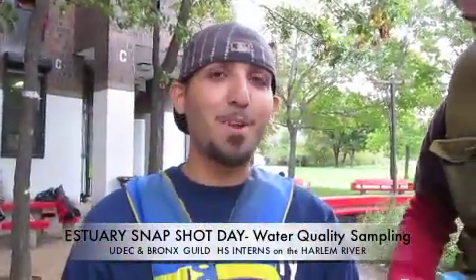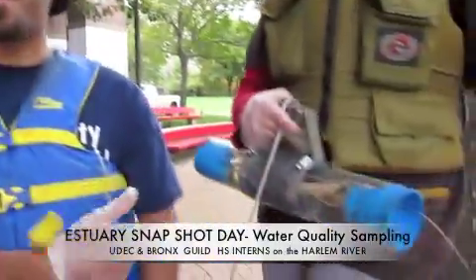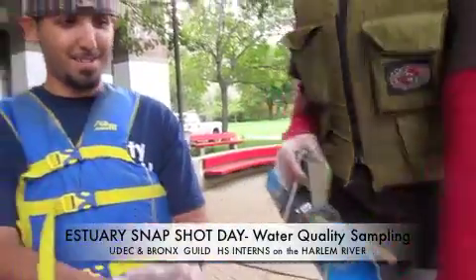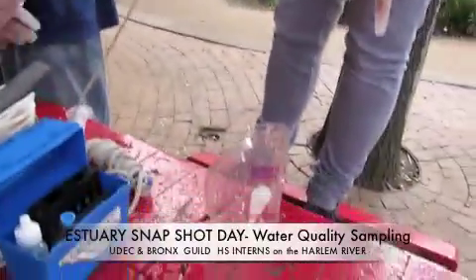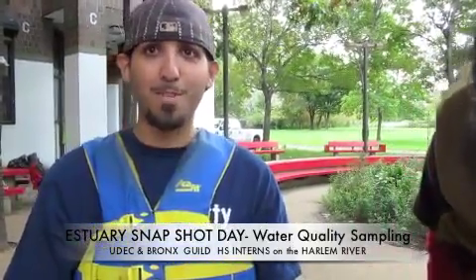The next test we are doing is for salinity. We're gonna be testing how much salt is in the water from the Harlem River into the hydrometer. How does the hydrometer work? The more salt in the water, it moves the needle. The less salt, it stays down.